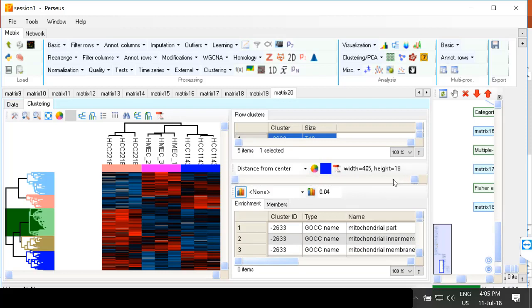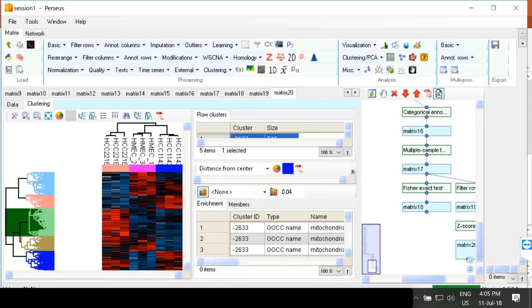We saw a lot of people have issues with the clustering, that they have only one huge cluster and they cannot have more than one. So don't worry. The issue here is that the computer is confused about their language settings, so that the number has a comma and not a dot. Once you change your computer to English settings, you will be able to do this, but hopefully we will fix this for the next version. Sorry for this.